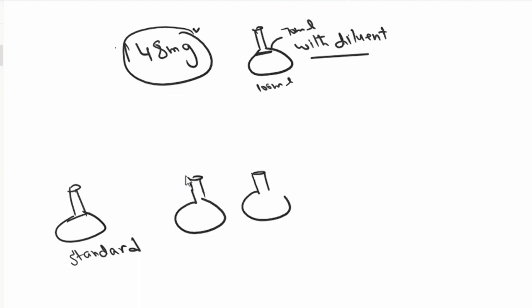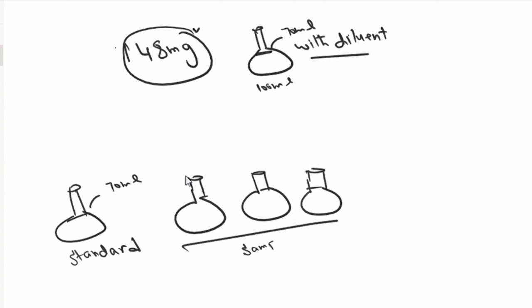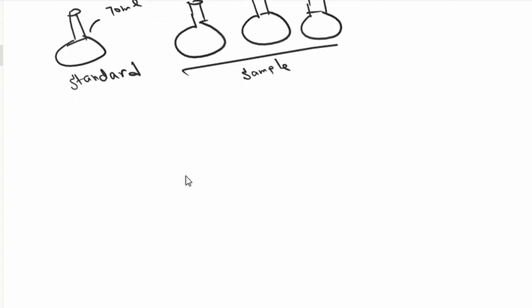You follow the same process, all up to the 70 ml mark. These are all samples, and you need to sonicate them, so you will follow the sonication.